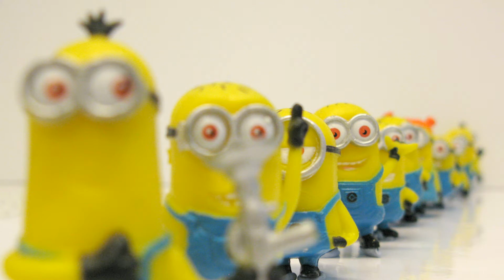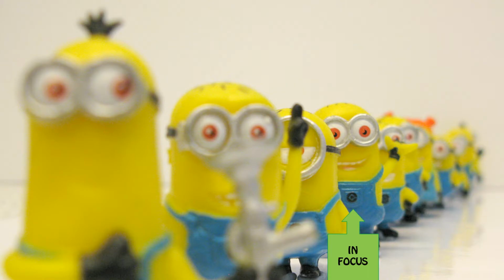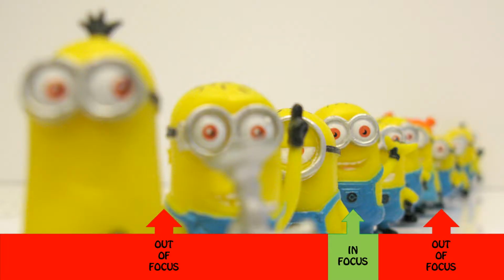But unless what we're looking at is very thin, flat, and aligned perpendicular to the lens system, there is stuff, that's a good technical term, both in front and behind the focus point, which is seen, but is seen out of focus. So the in-focus things are superimposed on a blur of the out-of-focus things in front and behind them.